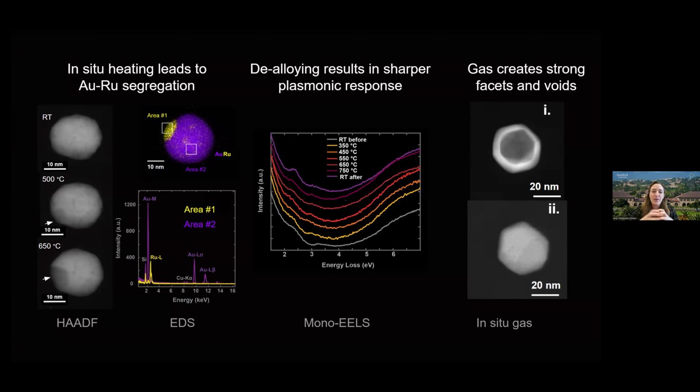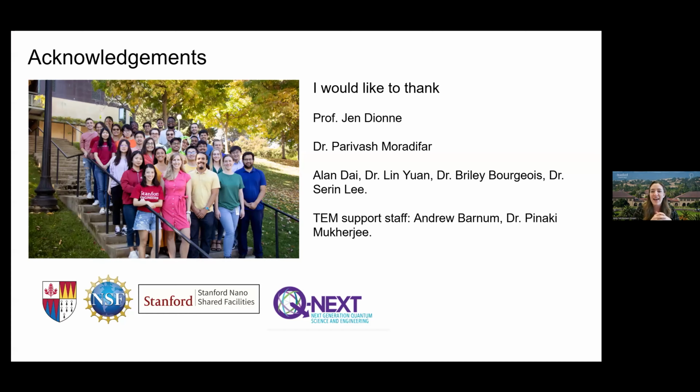So with that, to summarize, we first do in vacuum in situ heating to observe this gold ruthenium phase segregation confirmed by EDS. We use monochromated low-loss EELS to observe the changes in optical response of these catalysts during this phase segregation and observe an actually stronger plasmon post-separation. We finally add in gas to achieve more realistic catalysis conditions and see changes and tuning of the faceting and even internal structure of the catalysts.